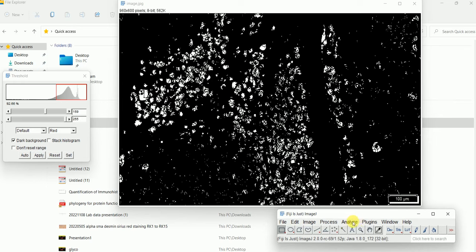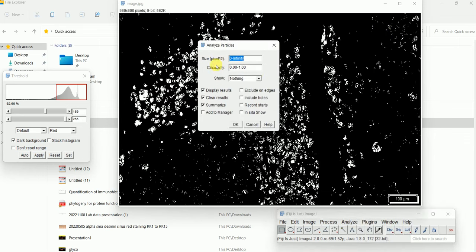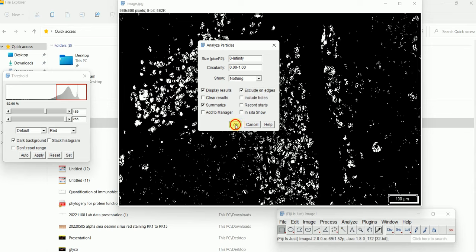After this, go to Analyze in your image software, and go to Analyze Particles. I have selected these options: Display Results, Clear Results, Summarize, and Exclude on Edges. You can also play around with the different options, but for demonstration I'm going to select Display Results, Summarize, and Exclude on Edges — so whatever is on the edges will be excluded. Then hit OK.